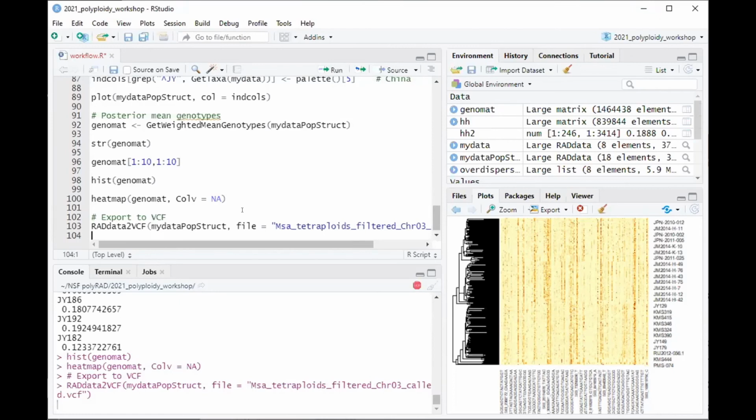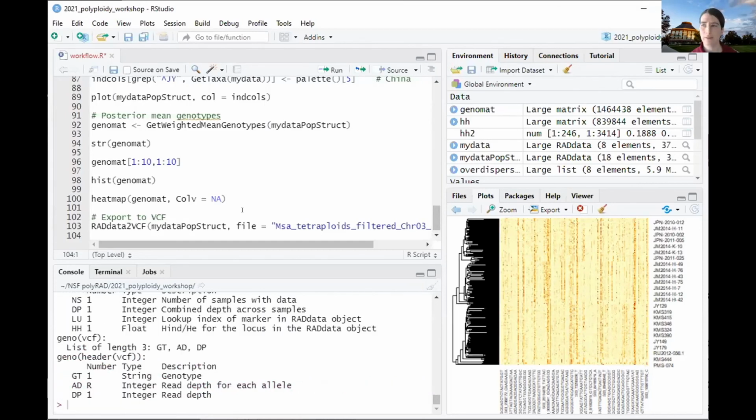This is Rajnish. I have a question. With this polyRAD, we got, okay, the population has the 4 ploidy level or tetra or something. Can we get after this, separate the lines which is coming in which particular ploidy level, like diploid or tetraploid or triploid? Can we separate in this polyRAD or not? In this case, if you have a mix of diploid and triploid and tetraploid, I would make those into separate RAD data objects and do the genotyping separately for each one.